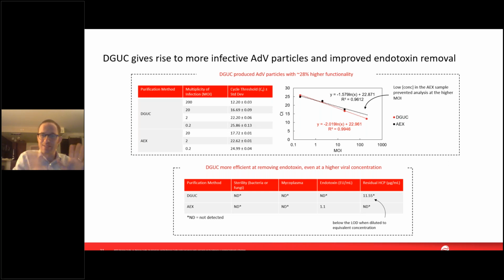So there we go. There were some things that I think we did very well in this experiment in terms of optimizing for runtime. We showed the different layers of gradient. We already had a pretty short runtime. There are some things that we could have done better as well. From the centrifuge perspective, we could have been using a rotor that was more suited for this purpose. But I hope this shows that the rotors are to some degree versatile in terms of what they can do.